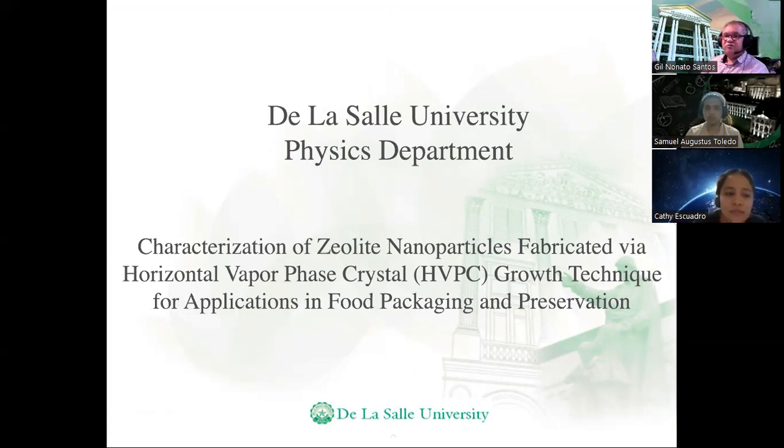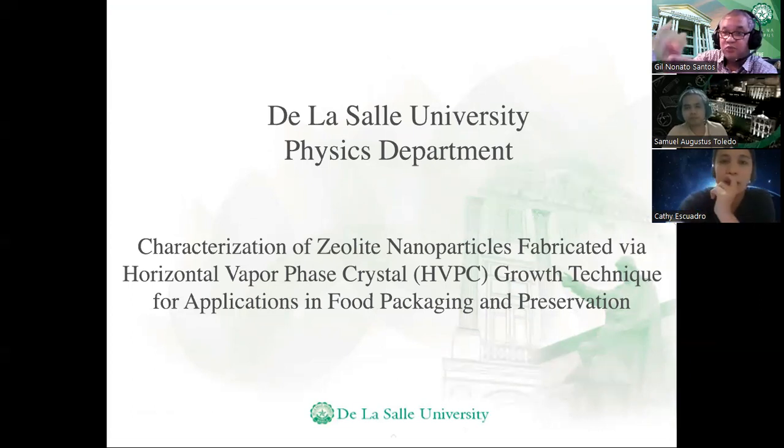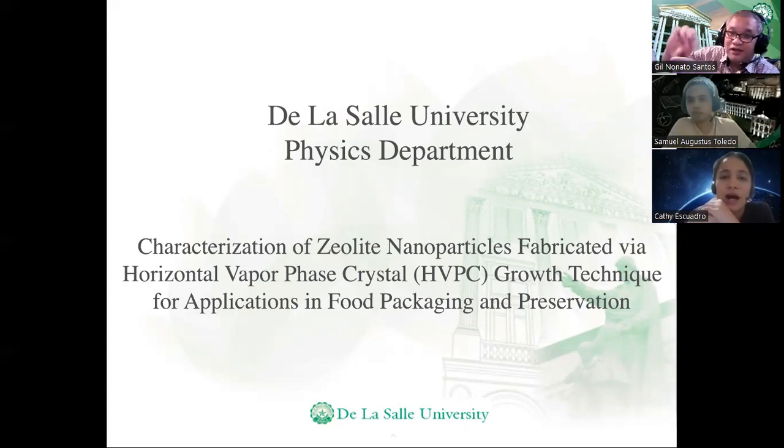No, we did not. We just made nanoparticles, and then you have your tubes. You have grown the nanoparticles there. And then the milk that is spoiled was actually poured in the tube. Okay, sir.